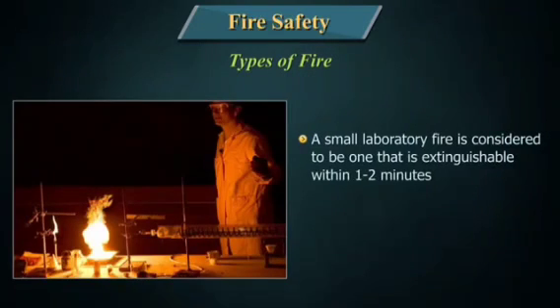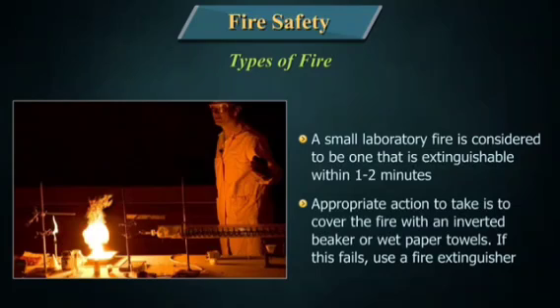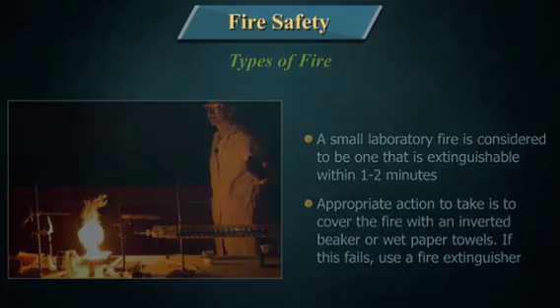A small laboratory fire is considered to be one that is extinguishable within 1 to 2 minutes. The appropriate action to take is to cover the fire with an inverted beaker or wet paper towels. If this fails, use a fire extinguisher.